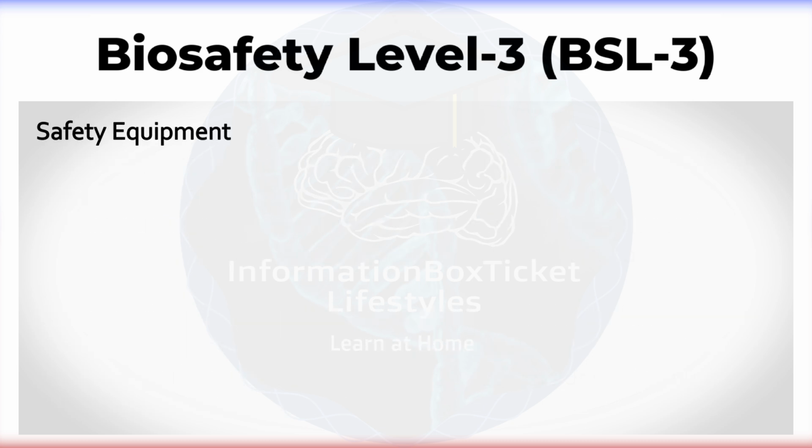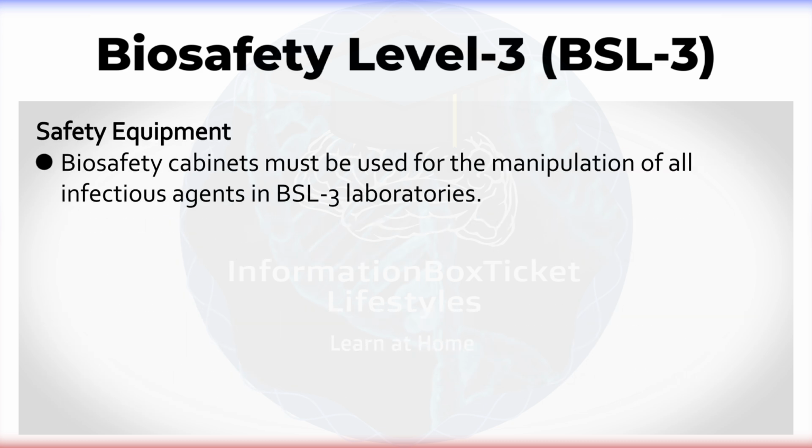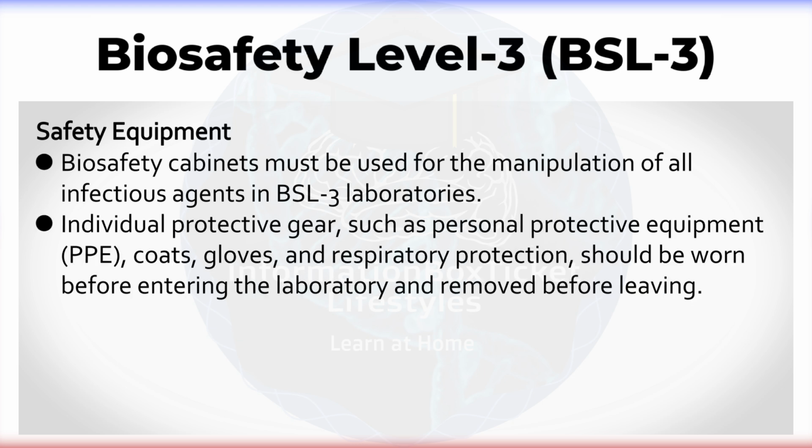Safety equipment. Biosafety cabinets must be used for the manipulation of all infectious agents in BSL-3 laboratories. Individual protective gear, such as personal protective equipment, coats, gloves, and respiratory protection, should be worn before entering the laboratory and removed before leaving.